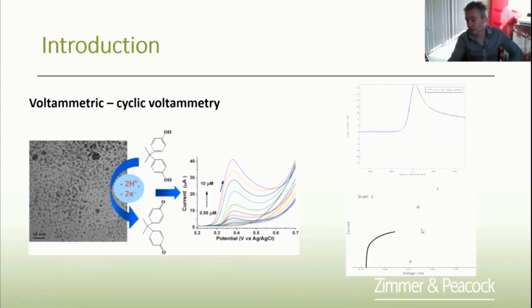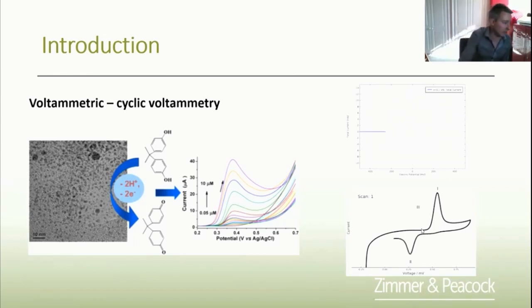We have another cartoon underneath. This is the cyclovoltammetry of capsaicin. So capsaicin is the molecule that makes chilies hot. In this experiment, the black line that's tracking across at the moment, the scientist is doing it much slower. But I just want you to notice something.